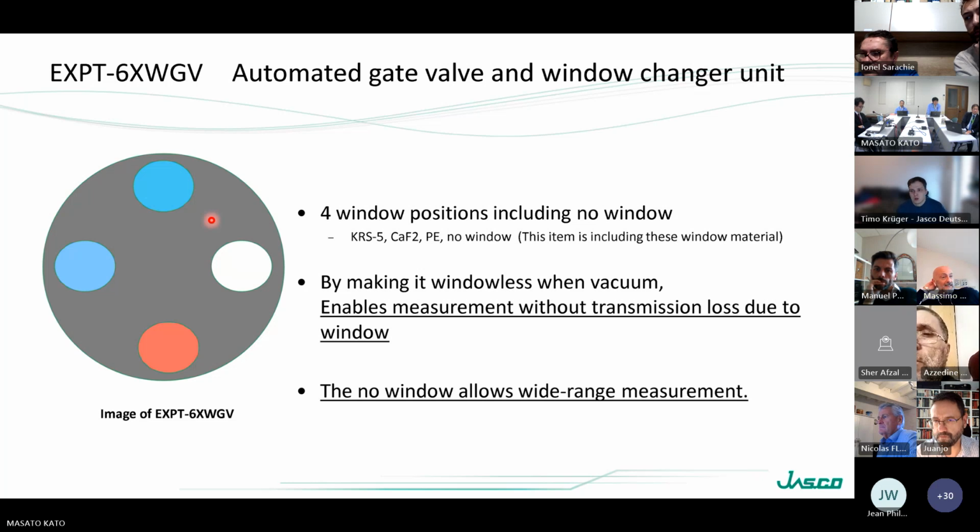So my question is, sometimes it's not difficult, but you need a lot of time to make a reply. Is it possible to have three standard configurations, including all the optics, in order to accommodate an external laser, an external furnace, maybe giving some indication about which kind of black body and furnace the local dealer has to purchase, and optics in order to use a bolometer from the detector side? Three standard configurations in order to have at least the feeling of what the price should be and to give an immediate reply to the customer.